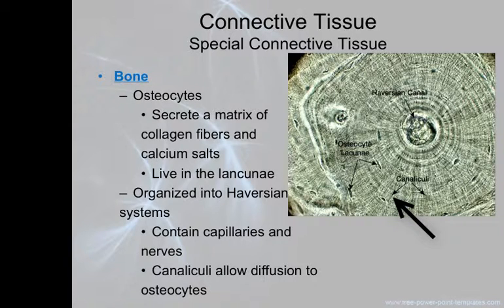The canaliculi are small transverse canals, meaning sideways canals, that connect the osteocytes. They allow the exchange of cytoplasm, another material, through the bone from one osteocyte to another. The function of bone, that's just locomotion and protection of your organs.